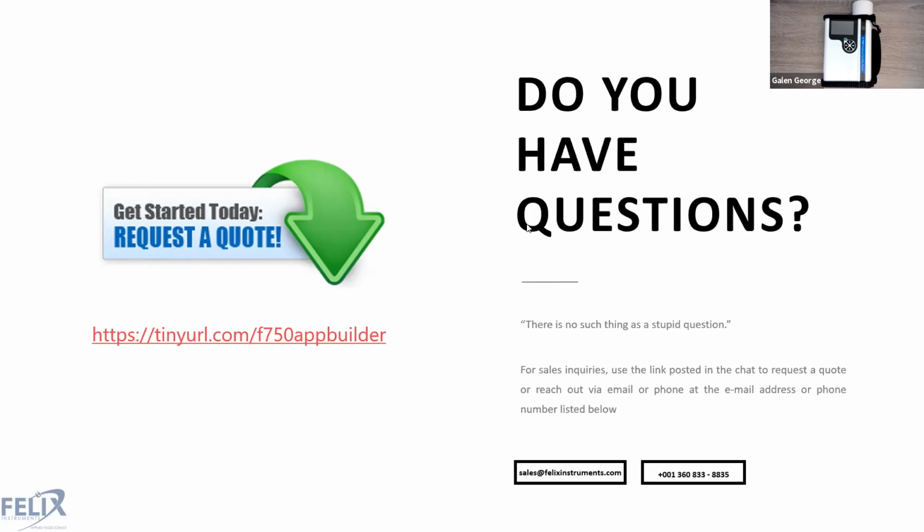If you recall, on the legacy Gen 1 instruments, when you take measurements, those DAT files were just stored freely in the root menu of the SD card. So now this allows you to rapidly package those into neat folders, as well as rapidly upload wirelessly to a data server, or to FruitMaps. And like I said, there is more information about how to specifically do that in the manual.